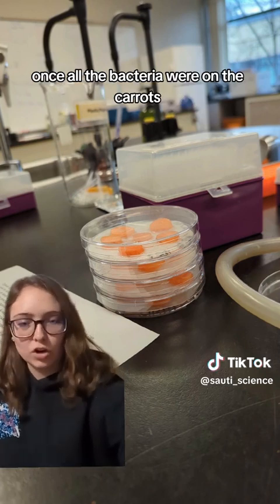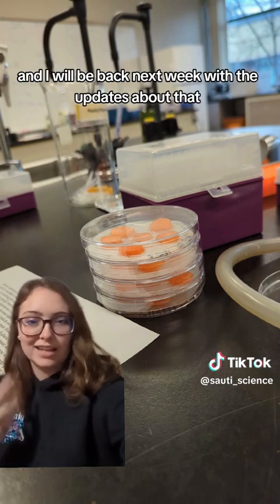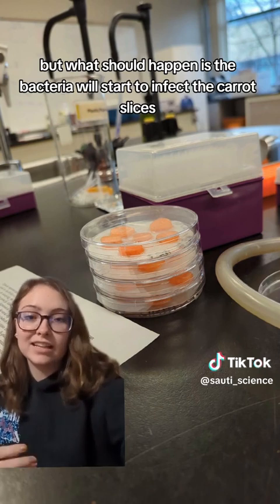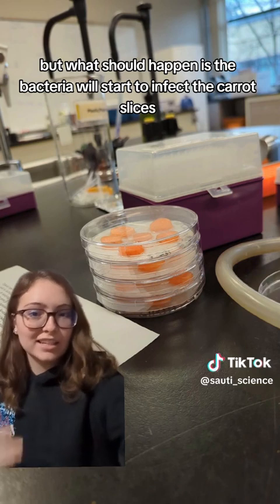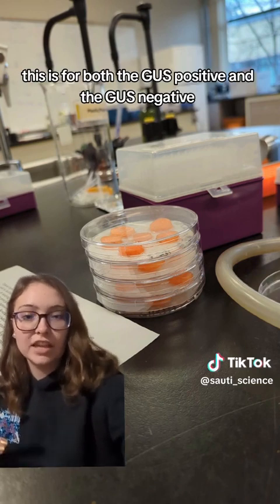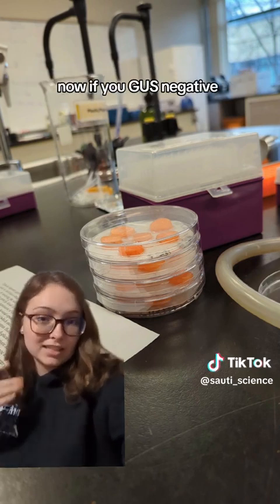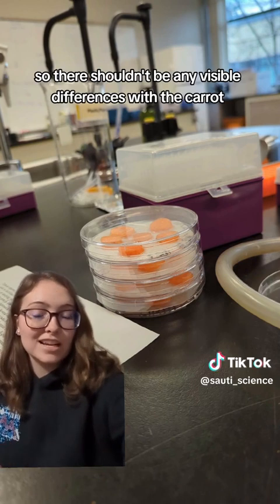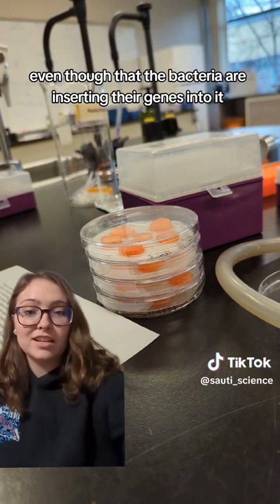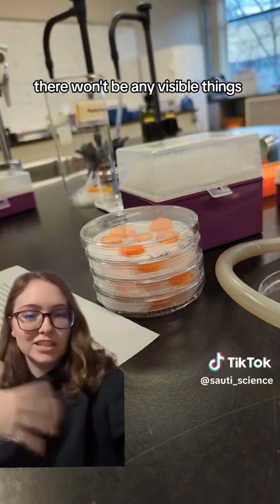Once all the bacteria were on the carrots, we just had to leave them to cook for a week. What should happen is the bacteria will start to infect the carrot slices — this is for both GUS positive and GUS negative — and will insert their genes into the carrot cells. For the GUS negative, they're the negative control, so there shouldn't be any visible differences with the carrot, even though the bacteria are inserting their genes.